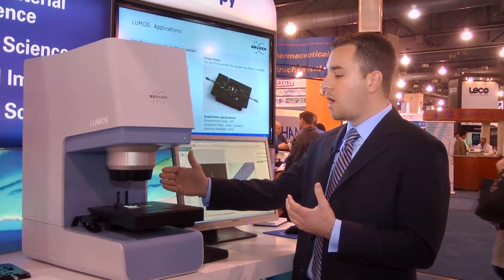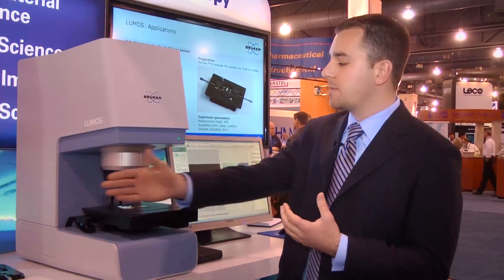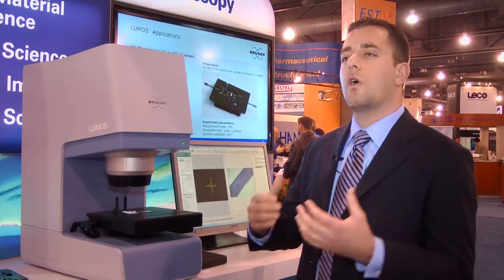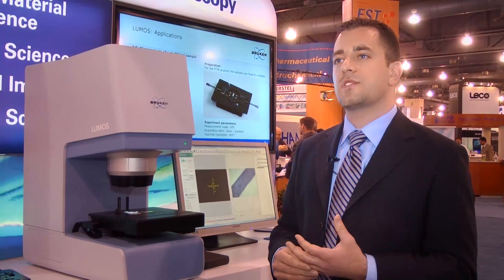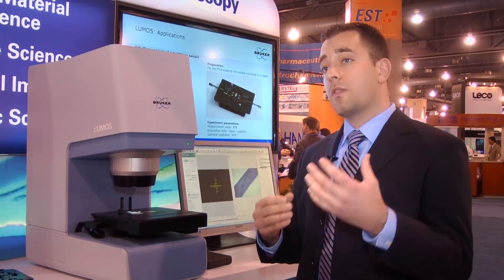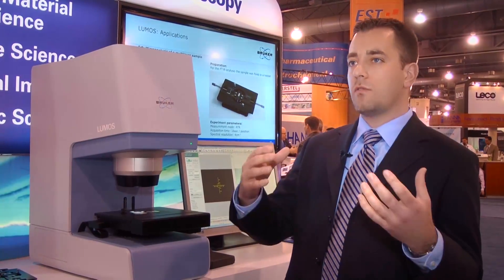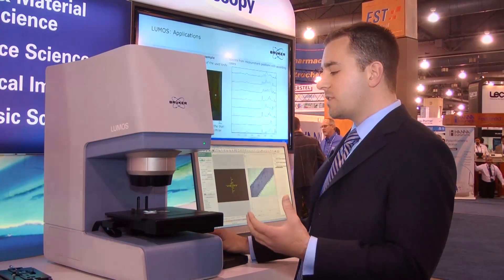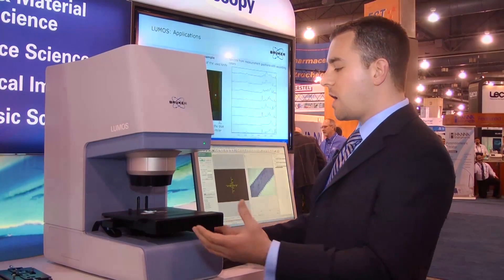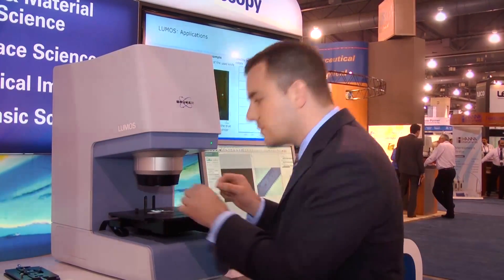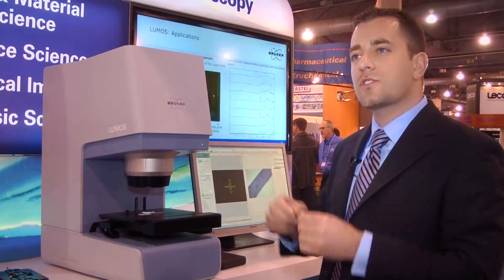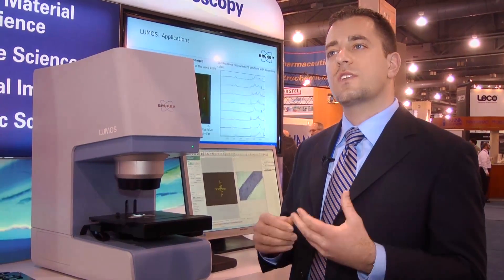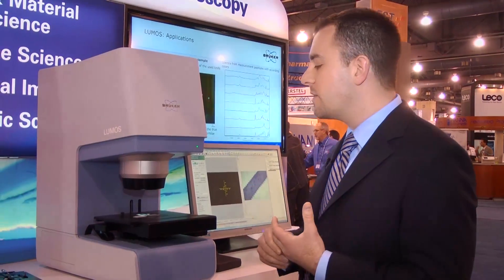You can see the large open concept we have here, which means that you have a lot of working distance for a lot of different types of samples, whether they're small or large. It really enables the user to bring the sample stage out without having to reach into the microscope and use tweezers to place their samples.